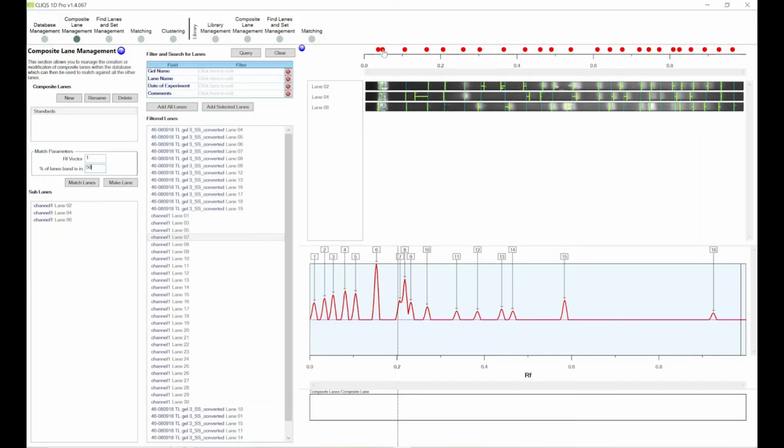We've got these red spots above this value here, which is our RF value. If we click on those, these red spots indicate potential matches. And as you click them, it allows you to visually see where the matches lie. We'll do this further along when we come to the main matching section.